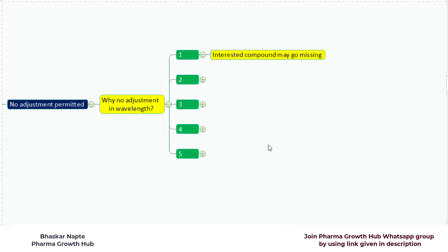How is this possible? Let's say you have a detection wavelength of 254 nanometer given in a monograph method. If you decide to change the detection wavelength to 300 nanometer, and if there is no absorbance found for the compound at 300 nanometer, then that particular compound will never get detected with your changed detection wavelength. Even though that compound is present inside the sample, it will just go missing.